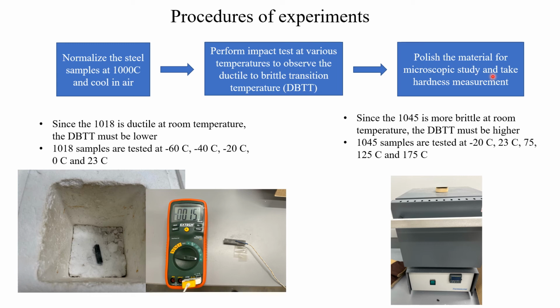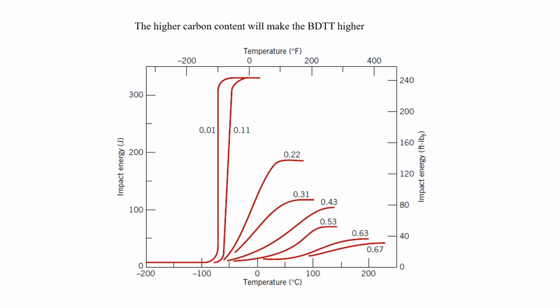Once you have the impact energy written down, you're going to compare how the temperature affects impact energy.